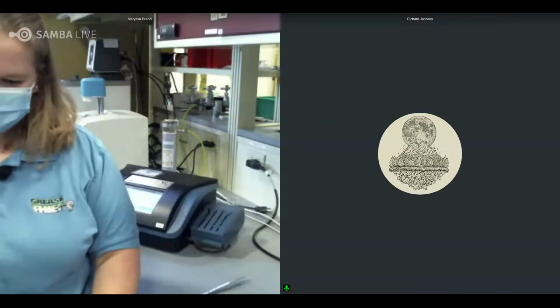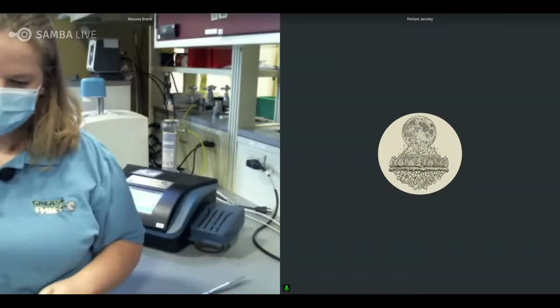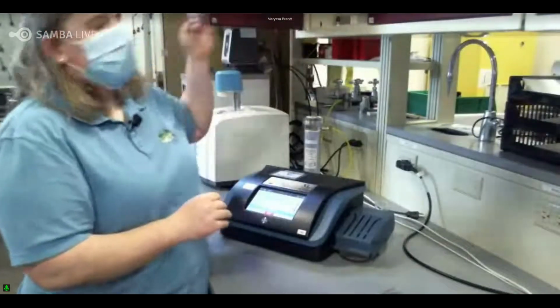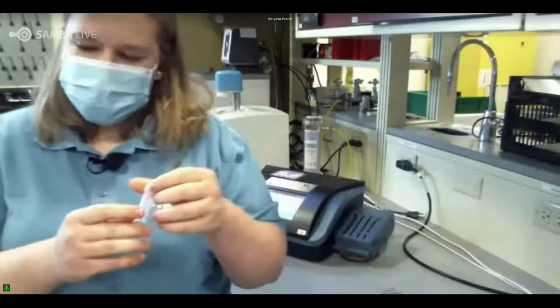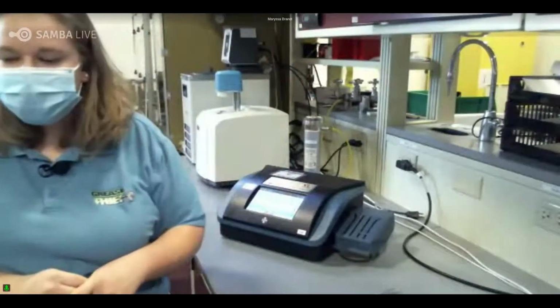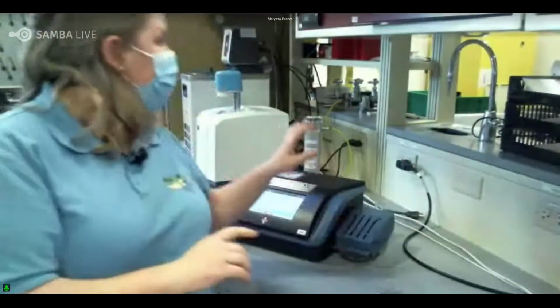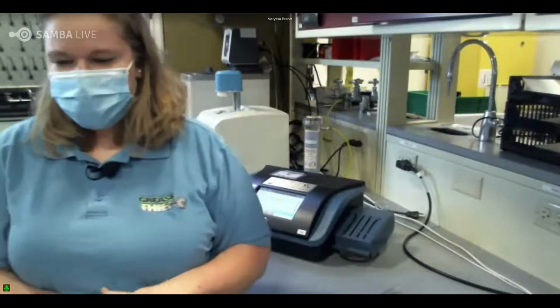The next question would be, do you have to calibrate or zero the instrument before each use? You do not have to do it before each use. You do have to do it daily. The calibration is actually up here. So we're going to take a micro cap that is preset to a specific volume, and you just put it in the instrument, and it has a calibration setting. It's as simple as putting this microcap in water, putting it into a vial, and testing it on the instrument for calibration. We do it daily. It does not need to be done after every single sample, though.